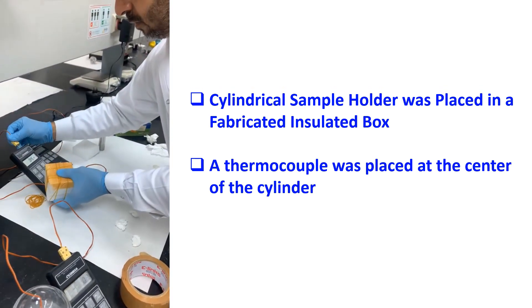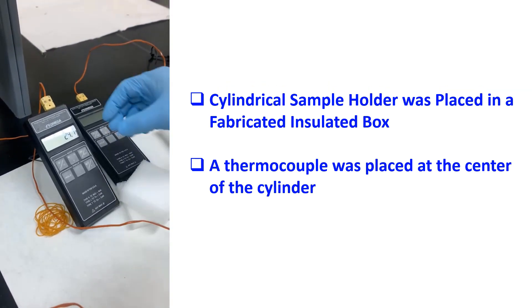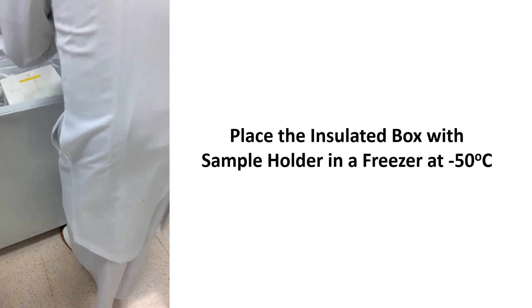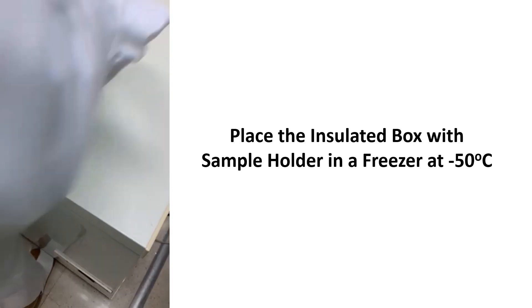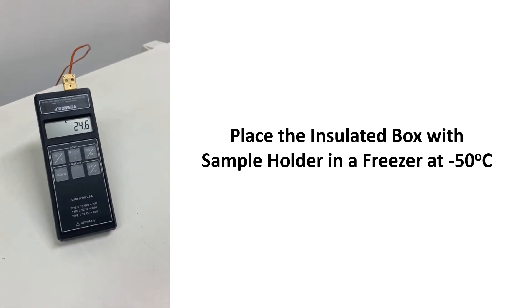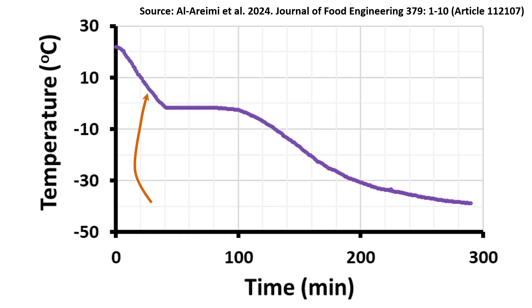We are now checking the initial temperature of the sample; it is showing 24.1 degrees C. The insulated box with the sample holder was then placed in the freezer at minus 50 degrees C and time was counted from zero. The initial temperature was 24.6 degrees C. Temperature recording was started at, for example, one-minute intervals until it reaches equilibrium.